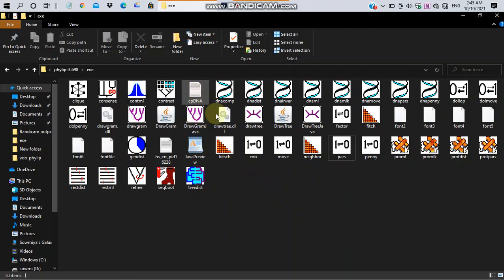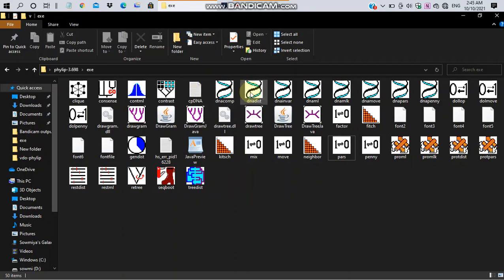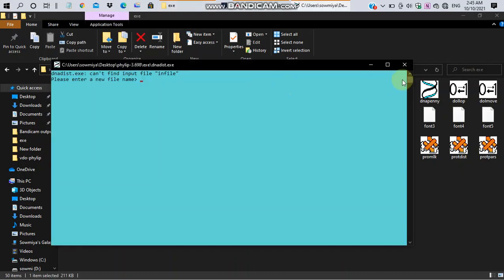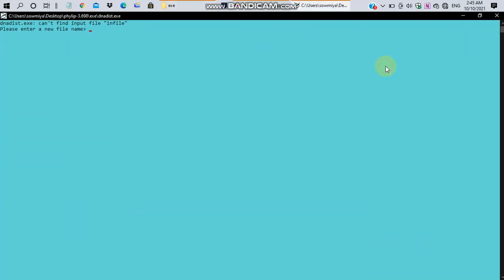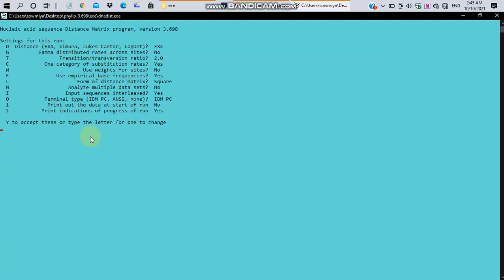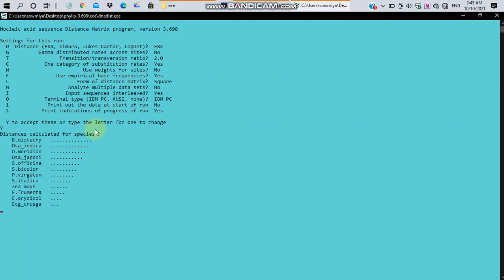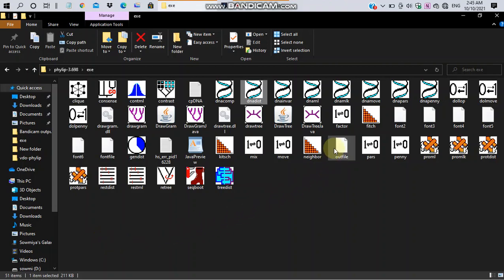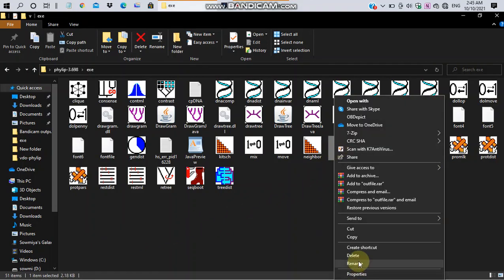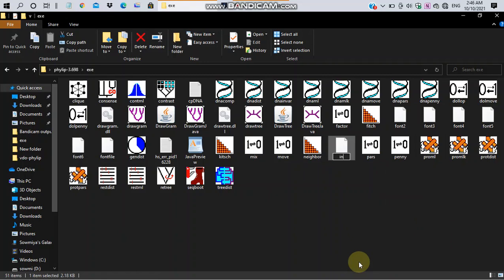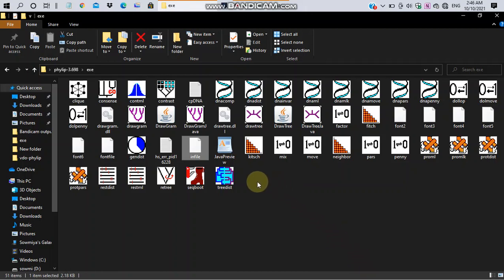Let's begin with distance-based method. In distance-based method, the first step is to retrieve the input file in DNADist. For this, open DNADist and enter the file name cpdna.txt and click enter. This will load the default parameters for calculating distance matrix. Just enter y to accept this parameter. This will calculate the distance and generate an outfile. Just rename the outfile as infile.